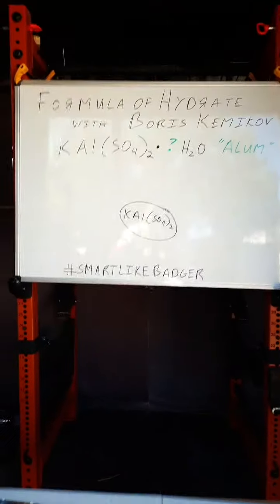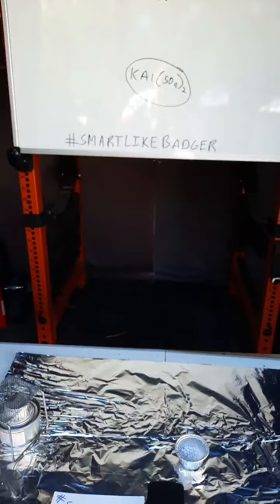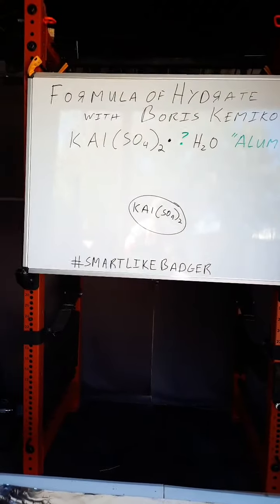But now we do some calculations with some Russian chemistry.